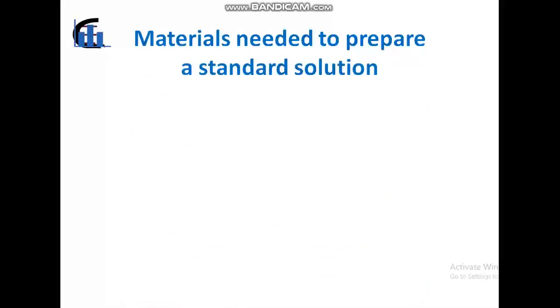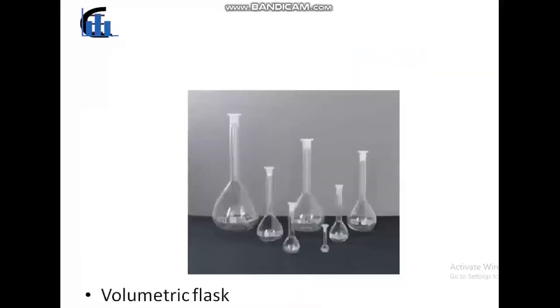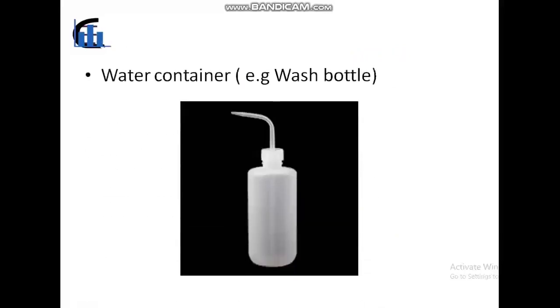Materials needed to prepare a standard solution. We have a beaker, volumetric flask, a funnel, and a water container, for example, a wash bottle.